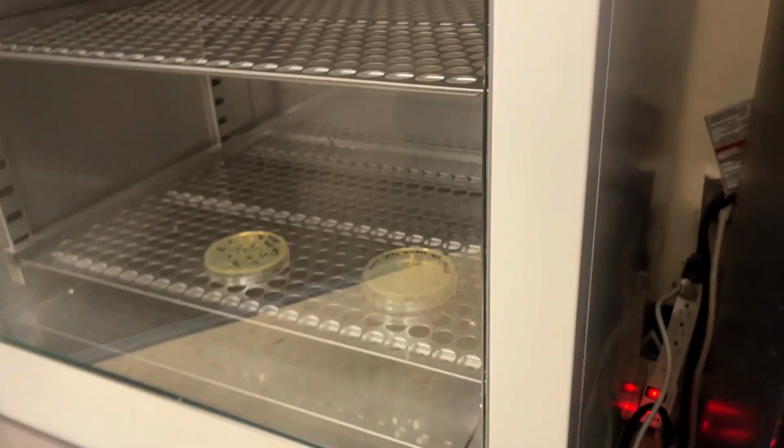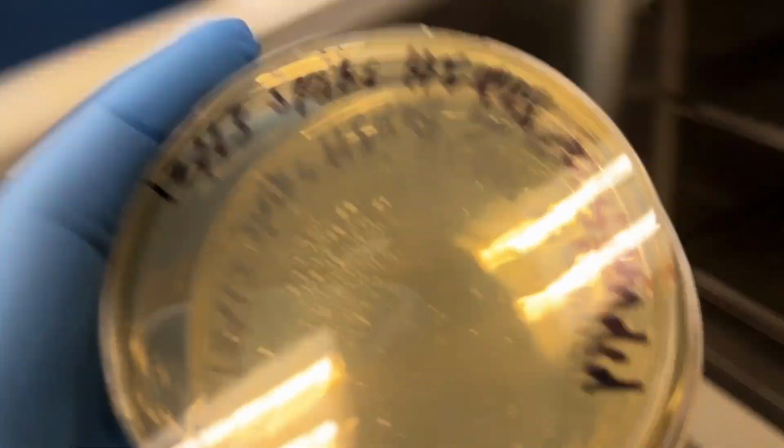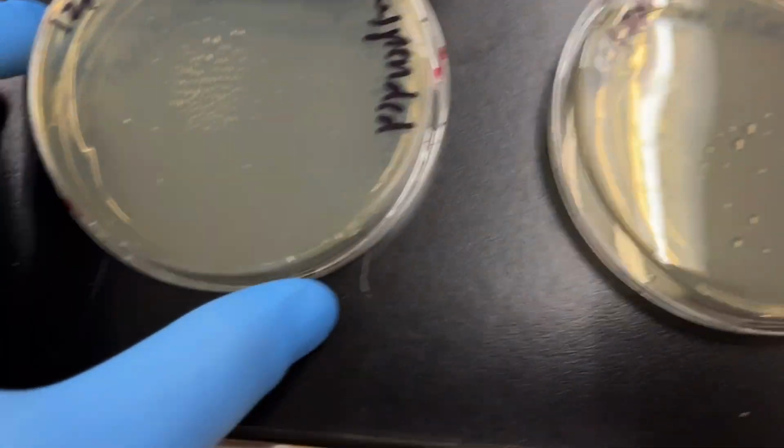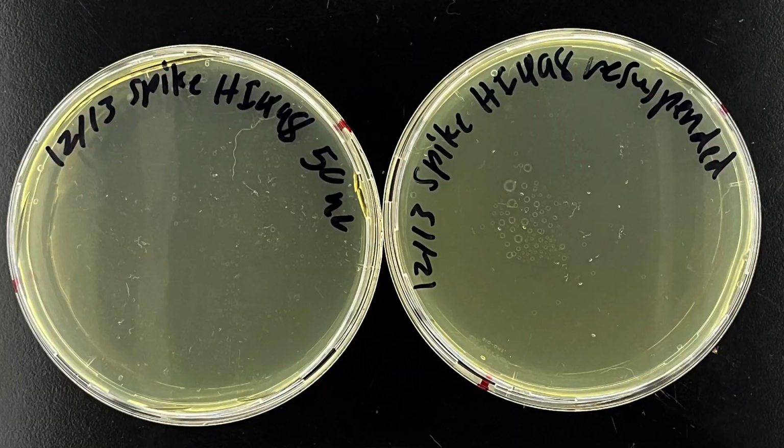And since Jaden couldn't be here the next day, I had to give him the news of failed transformation. So no colonies present. That's no good. I did take some better pictures, and so let's see what they look like. So unfortunately, no colonies on here, so this was a failed cloning attempt. Like I said, this has been a particularly tough one for, I'm not even really sure why, but Jaden will go back to the drawing board and we'll try it again.